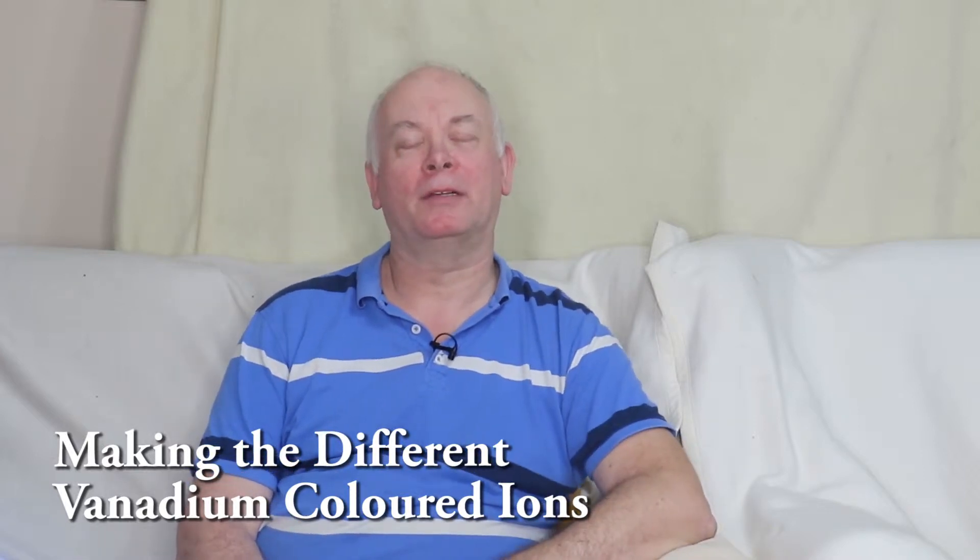This is one of the new experiments in the Chemistry 91 syllabus. We're going to have a look at the different oxidation states of vanadium, a transition metal. In this, we start off with ammonium metavanadate, which has the vanadium in the 5+. We're going to add this to some zinc and see what happens.